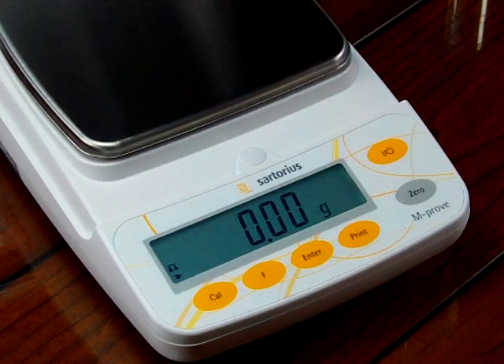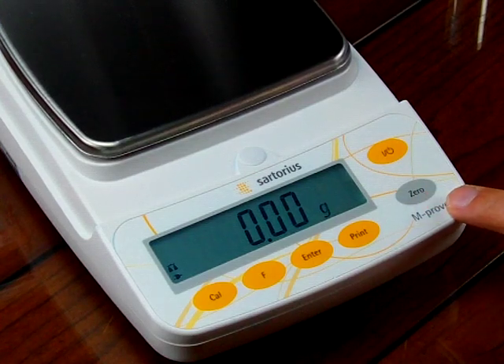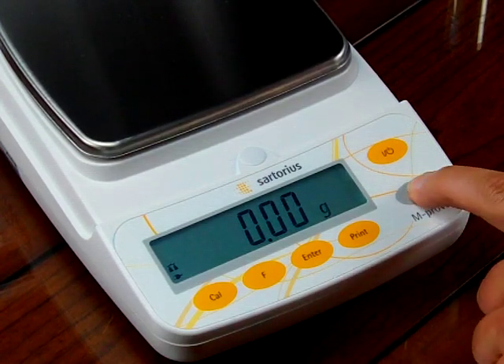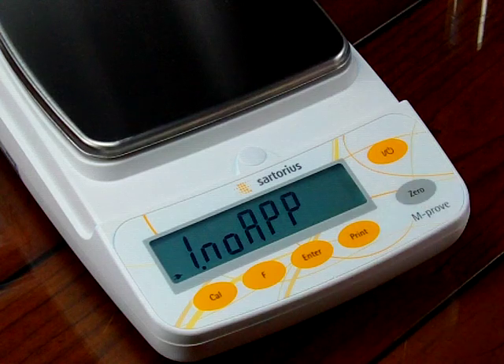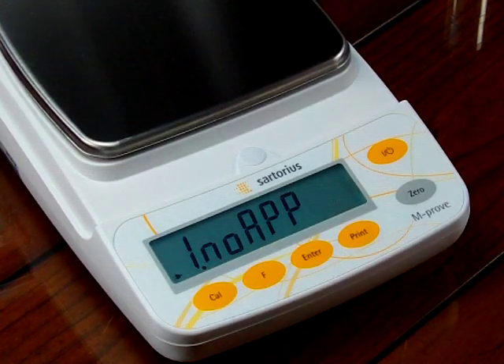To make the balance such that we can switch or toggle between weigh modes, we need to get into that function or application. To do so, we need to press and hold down the zero key. Holding it down, you'll see this is the first application — that's a one — and then it says no app, meaning no application.